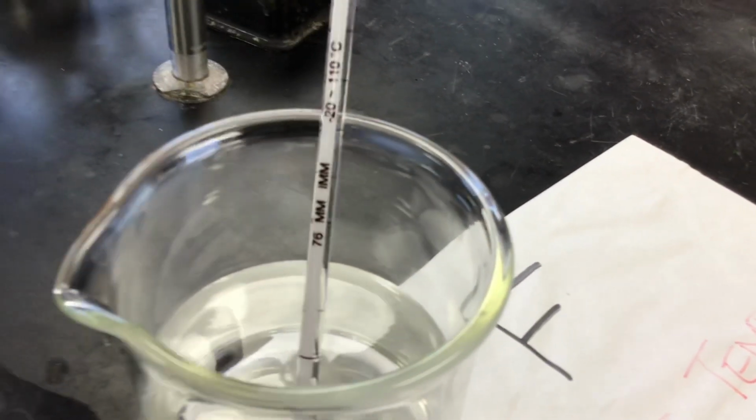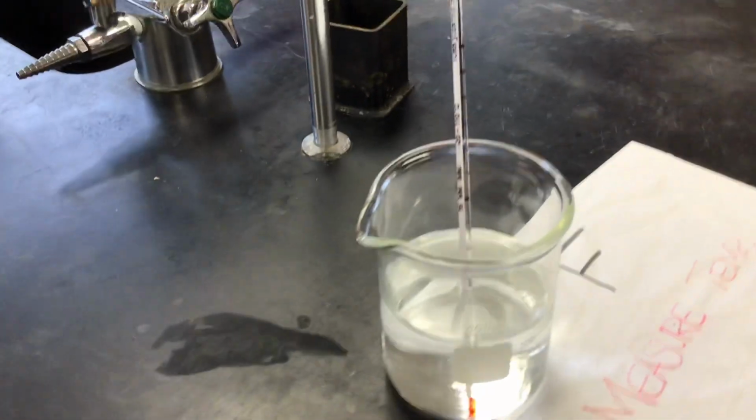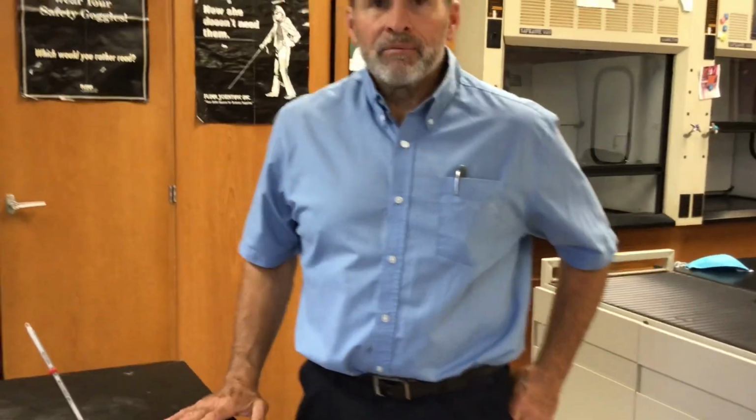Okay, now remember, when you write down your measurement, it's important to write the measurement correctly. That's the big deal in this lab. And in case you missed the hint earlier, units are important. Some of our measurements are calculated now, so we want to round to the correct number. Right, sig-figs. There could be some calculations that you have to do. Remember, there's rules for how you handle significant figures when doing calculations.